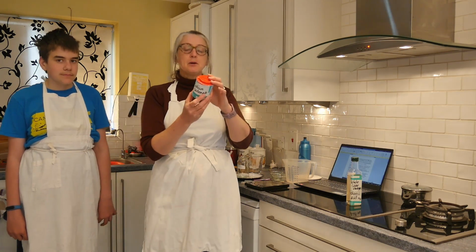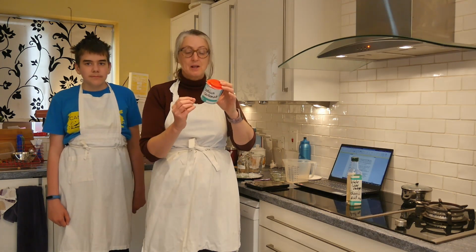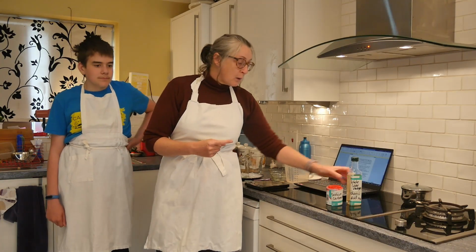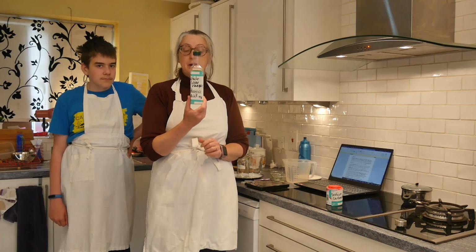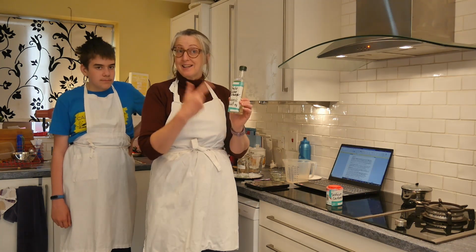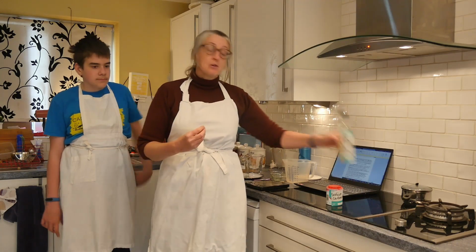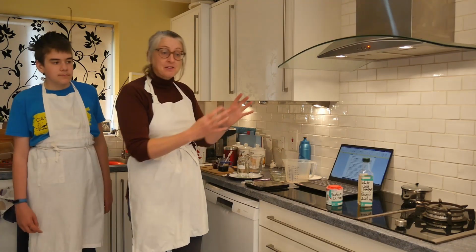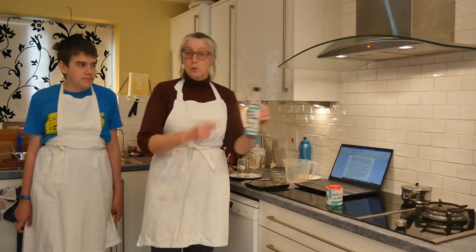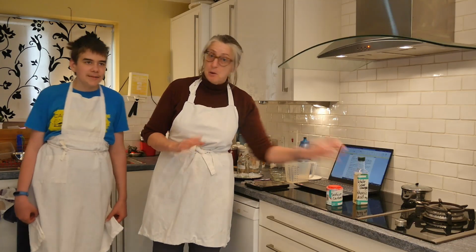It's fairly pure sodium carbonate, but it does have some extra bits and pieces in it. Okay, so it's got impurities in it. Whereas my white wine vinegar, my ethanoic acid, says that it's 99% pure. That doesn't mean to say that the concentration of ethanoic acid in there is actually 99%, so it's not actually giving us the concentration of ethanoic acid in the liquid. Normally when you do this in a lab, you would know what concentration one of your solutions was. We're going to pretend we know what concentration this is, but we don't really.